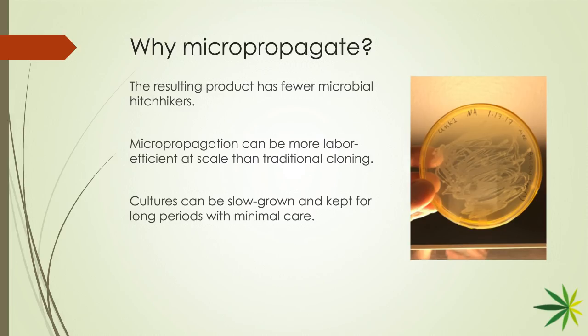One of the first reasons that we can make the claim that it's more labor efficient is honestly just the amount of care and the number of touches that you have to have on your sample. It takes a bit of care to prep a plant and harvest the material, but it's all done in a very small, compact space, a single worker with fast hands, and quite a large number. And once the cultures are sitting on the shelf and you have a properly designed facility and you have your sanitation and your aseptic methods worked out, you very rarely have to visit the cultures for long periods of time. So they can sit and do their growing, and there are interesting challenges when it comes to designing these shelving systems.